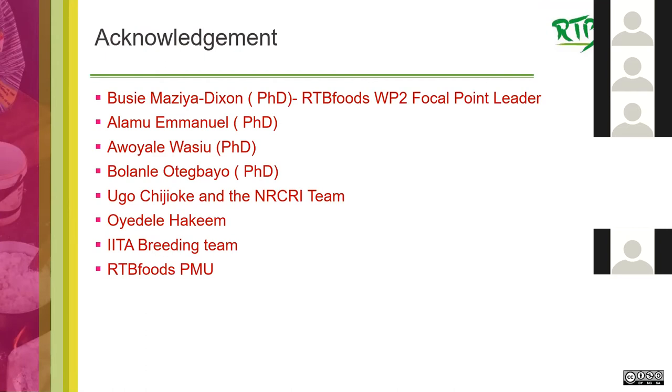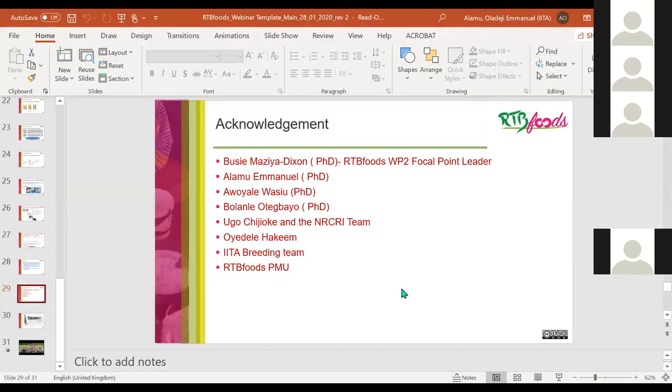And this offers a very clear and well illustrated picture of the protocols developed for EBA lab scale preparation, for textural profiling of EBA dough, and even for spectra acquisition on intermediate gari product at IITA Ibadan. And you have mentioned it as well: two other institutes have been collaborating on this work, NRCRI and Bowen University, for the sensory training. So thanks for acknowledging these cross-institute collaborations as well.